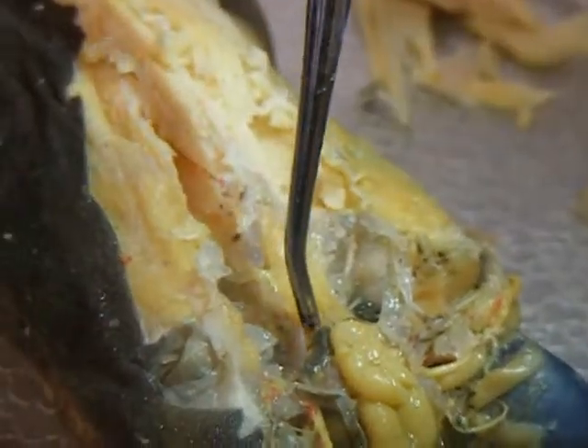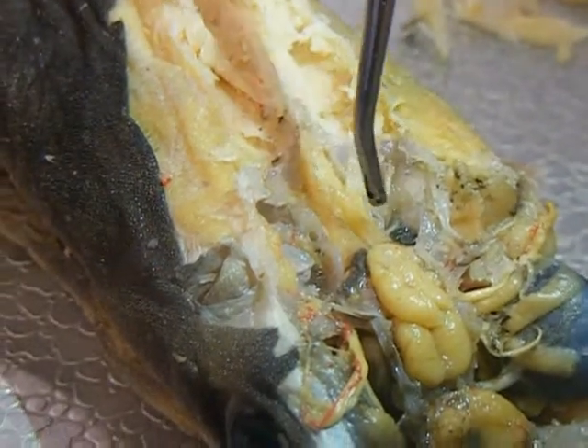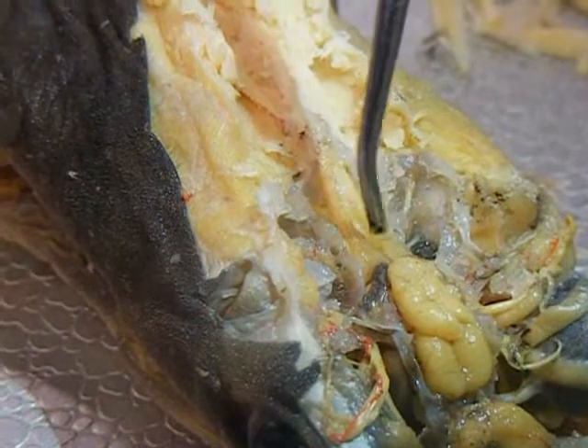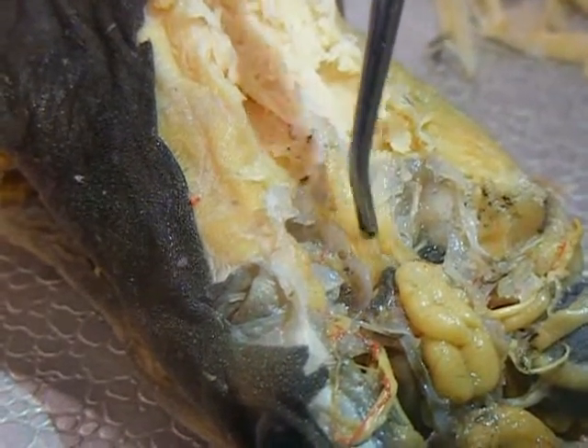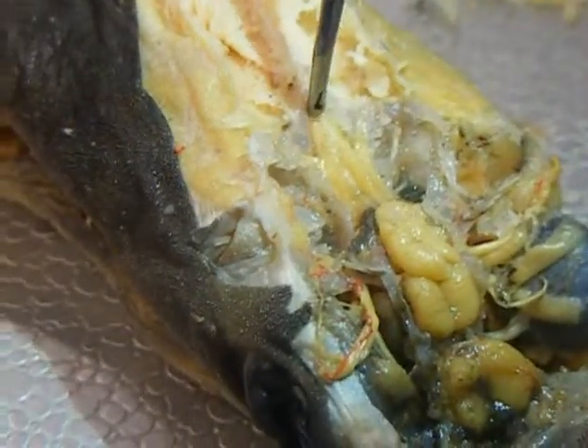Then behind the cerebellum you have the medulla oblongata. You can identify it because it has kind of a hole in the middle. And then from the medulla oblongata it goes into the spinal cord, which is down here.